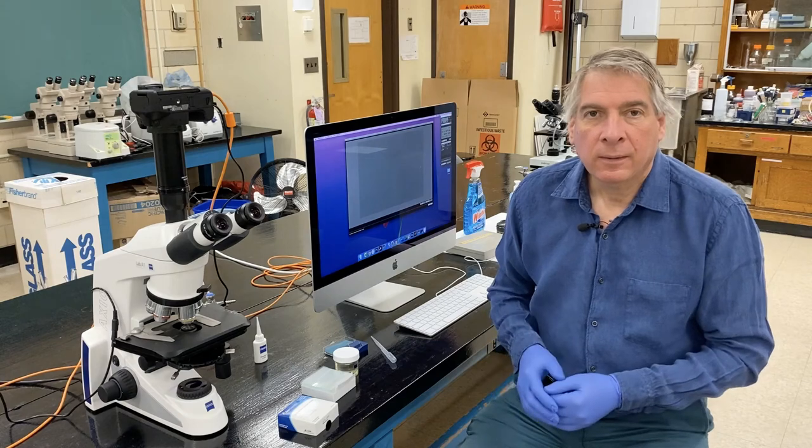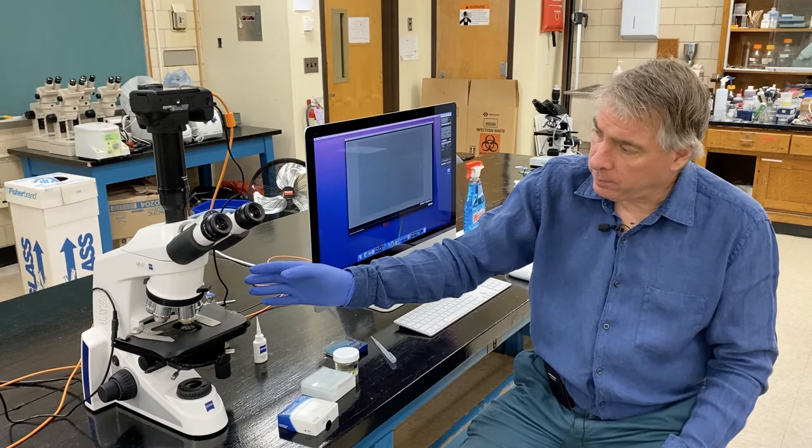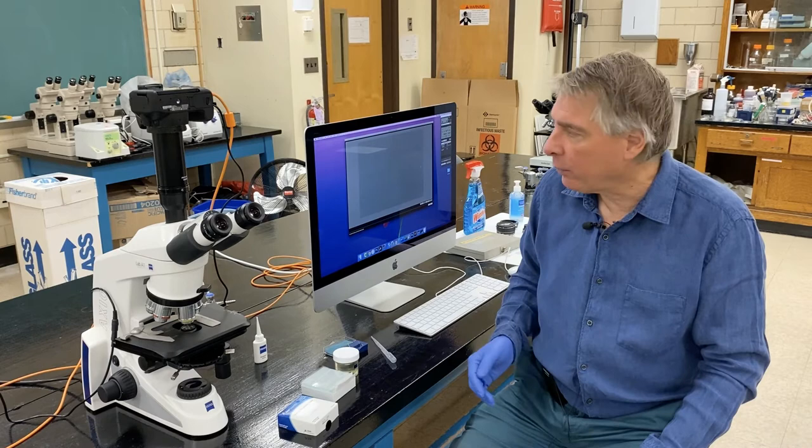Okay, so I've already entered the laboratory and put on a pair of gloves. I cleaned off the eyepieces with Windex and a paper towel. I turned on the microscope. I turned on the computer. I logged in with bioimaging.